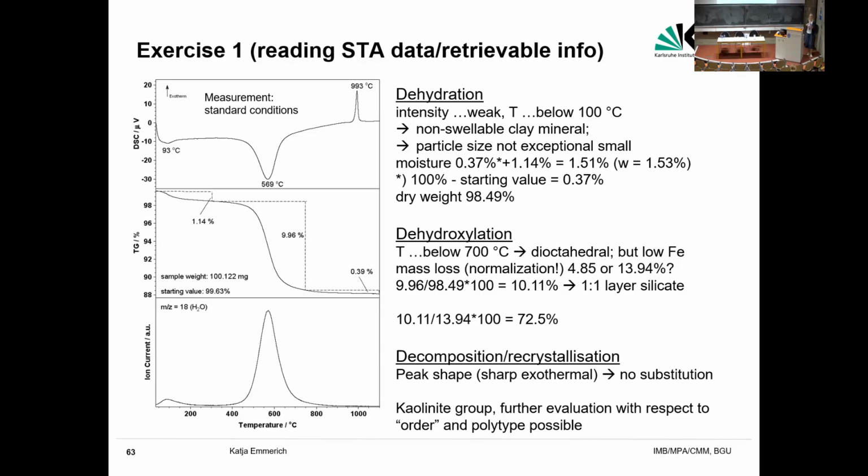And if you would then start right with the dynamic heating, the oven atmosphere still needs to be equilibrated again by the flowing air. That's why we wait a little bit to get a good baseline for the mass spectrometer curves, and we start with an isothermal segment for 10 minutes. But if you think about smectites or clay minerals in general, very fine-grained, as soon as you start flushing the sample with dry air, you will remove the water molecules from the outer surface.